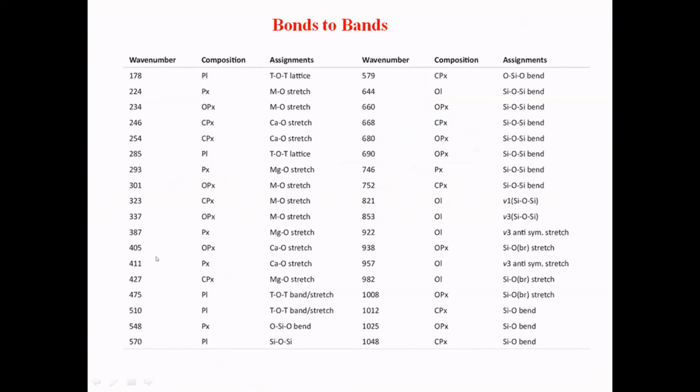We do not have to do anything. It's already been predicted years before, and people have assigned all the possible stretching modes of a molecule, and what kind of process it can undergo under the influence of doping and so on. They have assigned different point groups with respect to the wave number. So if you have data, you can simply compare the numbers and do the further analysis.